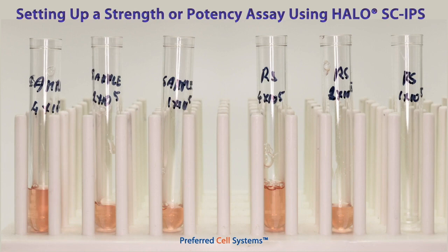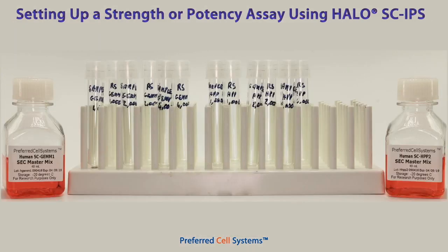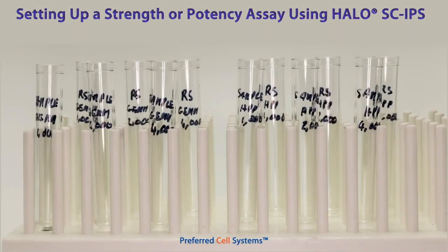A similar 3-point cell dilution is also prepared for the reference standard, which should be of the same tissue type and purity. We will then have 6 5-milliliter tubes for the sample and 6 5-milliliter tubes for the reference standard. 3 sample tubes will be labeled SCGEMM for each of the 3 cell doses, and the other 3 sample tubes will be labeled SCHPP for each of the 3 doses. The 6 reference standard tubes will be labeled similarly.